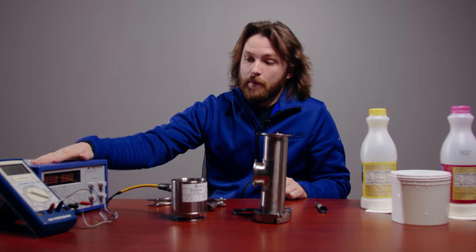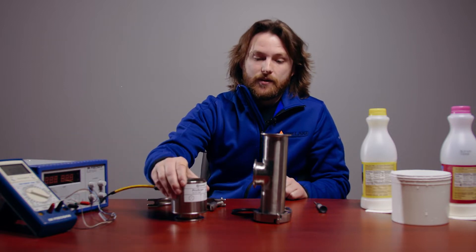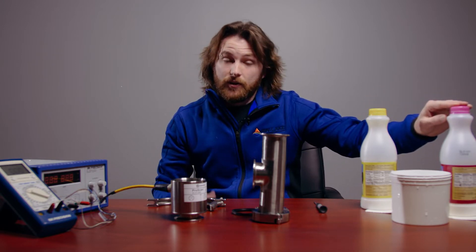Hi there, I'm Colton and today we're going to go over the setup and calibration of the ProScan infrared sensor. I'm going to be using a few tools to accomplish this today: my power supply, multimeter, my cable, my ProScan, and my Tri-Clamp T. The ProScan comes shipped with a default calibration, but we recommend using your own samples to get a more true result. Today I'm going to be using water, 1% milk, and half and half as an example. So let's get started.